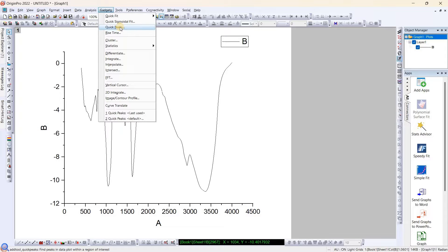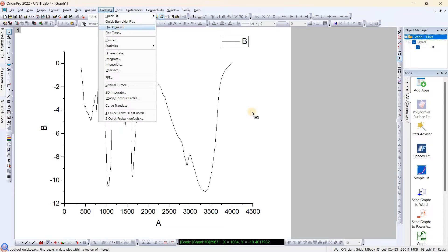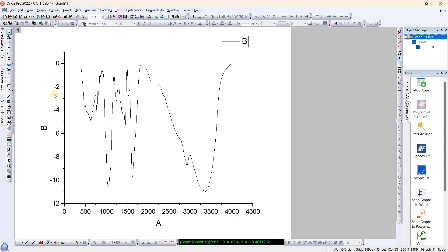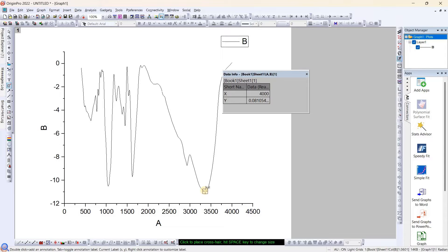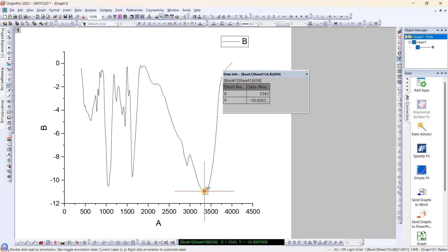First method is annotation. In this method it's a little bit hectic for me as per my experience. You need more precision to find the peak. Once you select your peak you need to double click it.